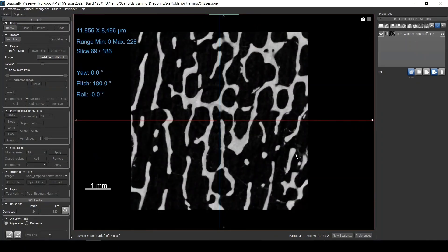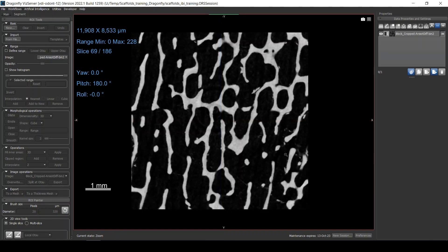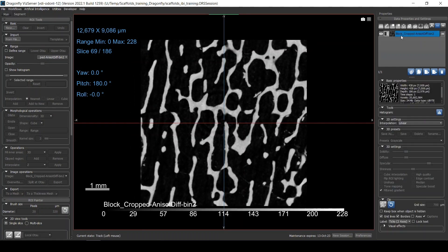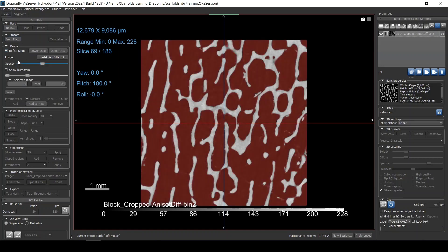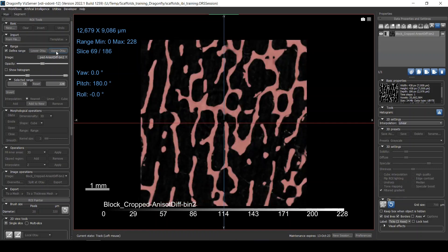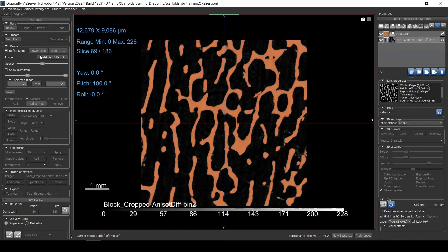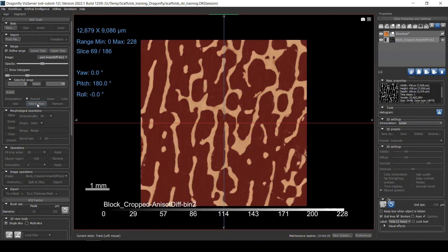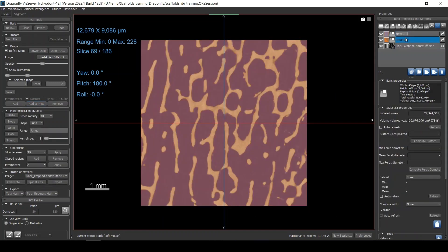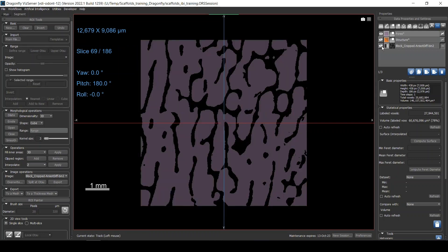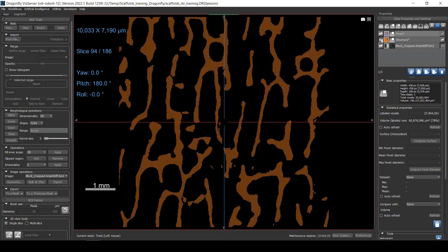What we're going to do first is segment the sample. This is quite simple — go to the Segment tab, define range, and use upper Otsu for the structure. I'll add it to a new region and call it 'structure,' and I can use the lower range for the pore space, which I'll call 'pores.' So now we have the pore space and the structure.